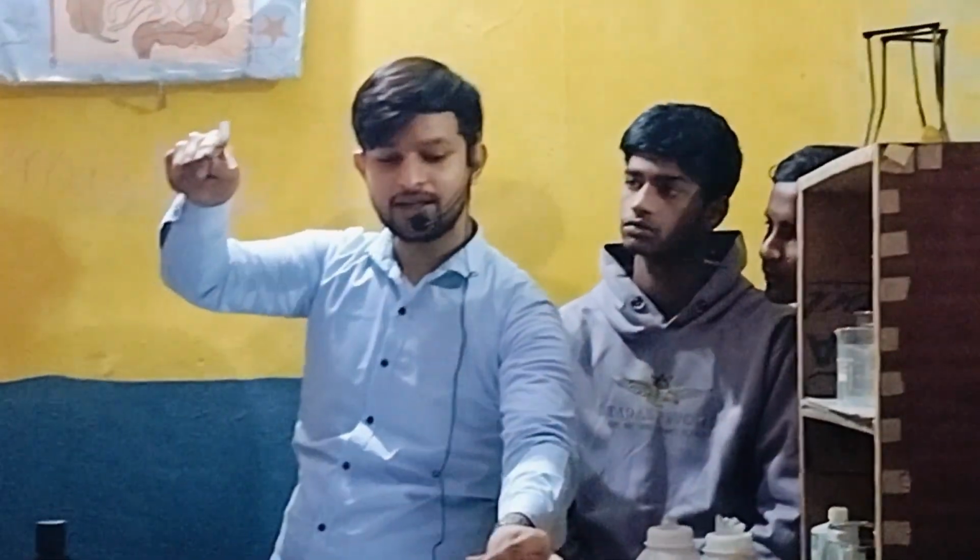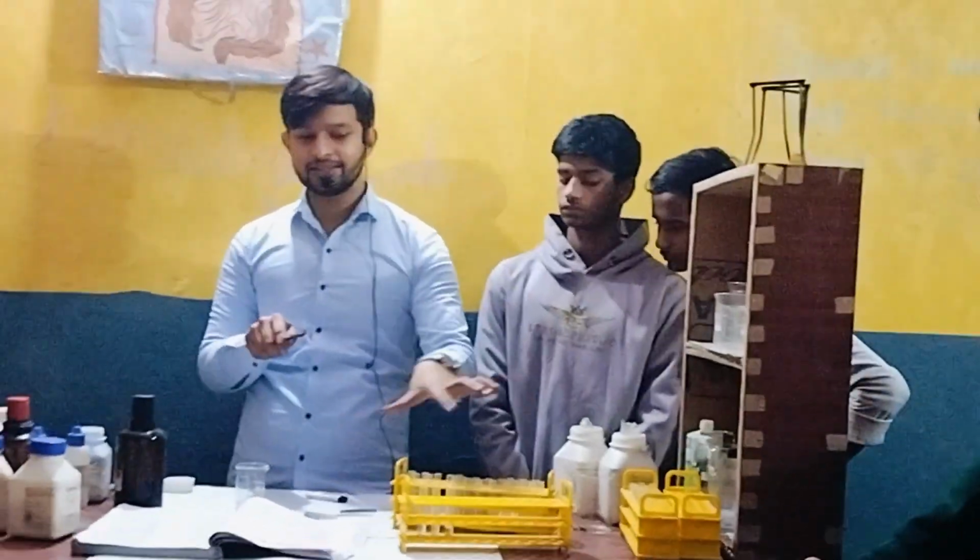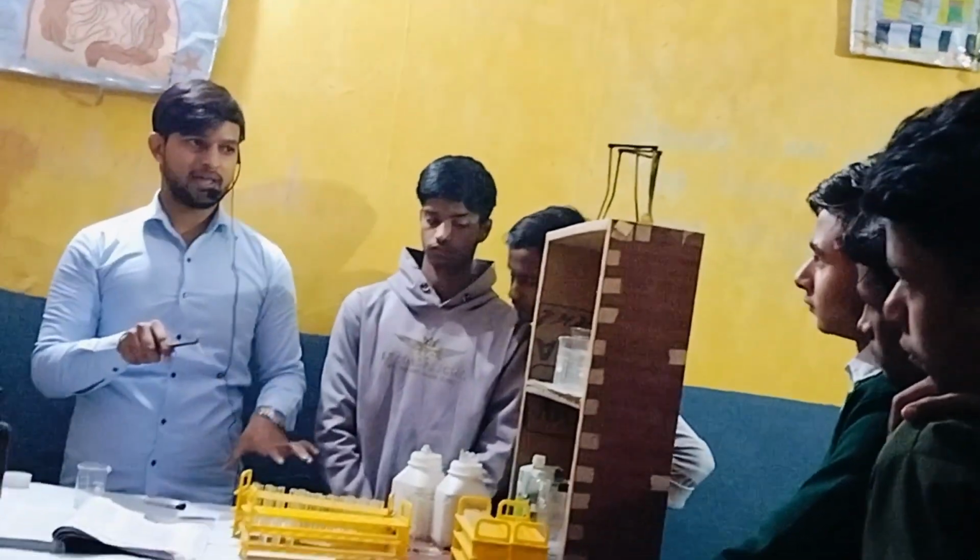Can you see the red color? Yes. See. So it confirms that pH paper indicates whether the chemical in this test tube is acid, base or water.